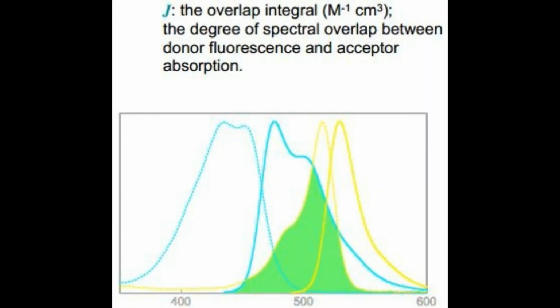A similar system called bioluminescence resonance energy transfer, or BRET, is also very similar to FRET, and the basis of the BRET analysis is that if two proteins interact and their position is such that the donor and acceptor are within a distance less than 10 nanometers, then the emission spectra of one protein can be absorbed by the second protein, and hence they will be able to create luminescence of the binding protein, like the two halves of the protein that they're attached to.